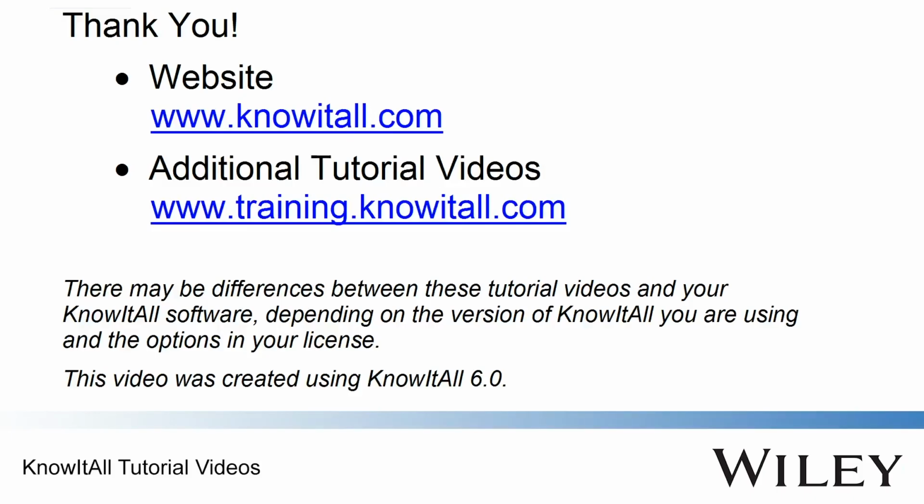This concludes our demonstration of how to perform a limited range spectral search in the KNOWITALL informatics system.